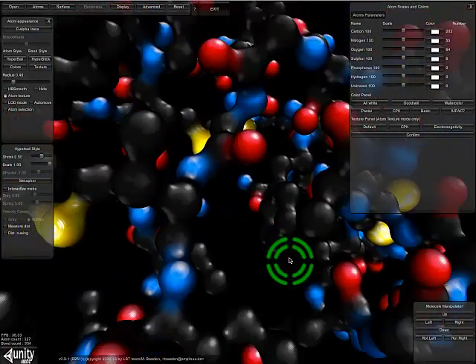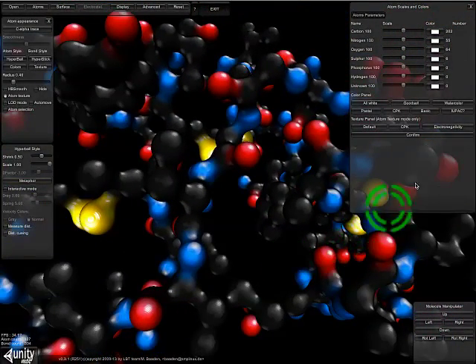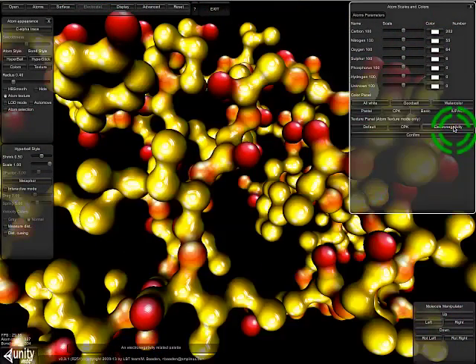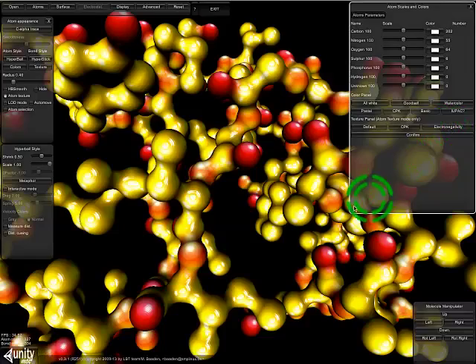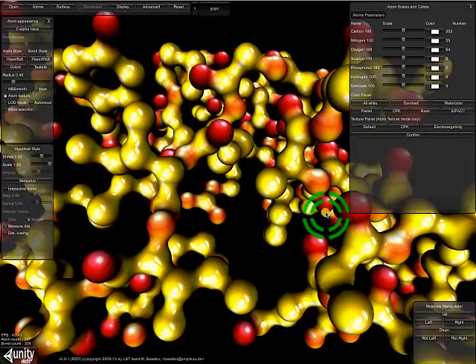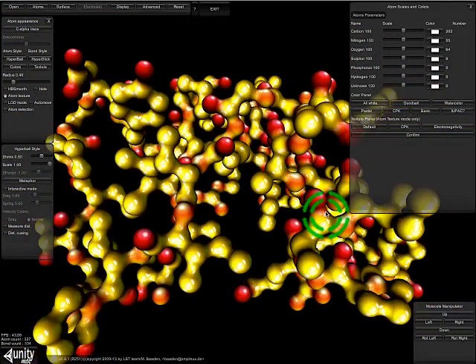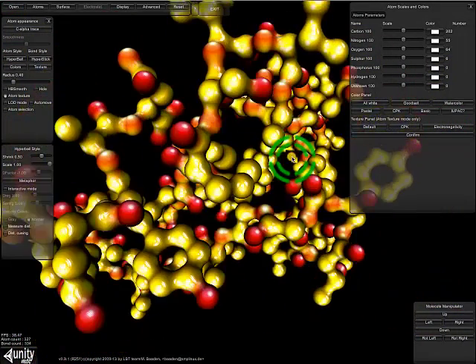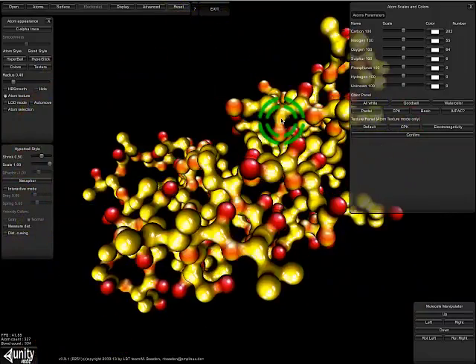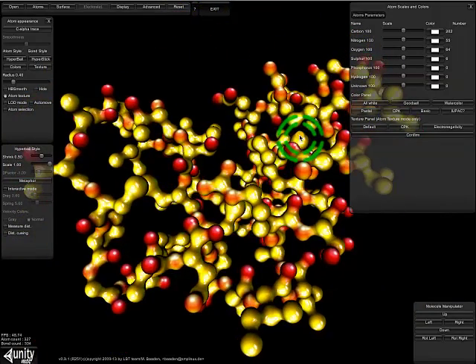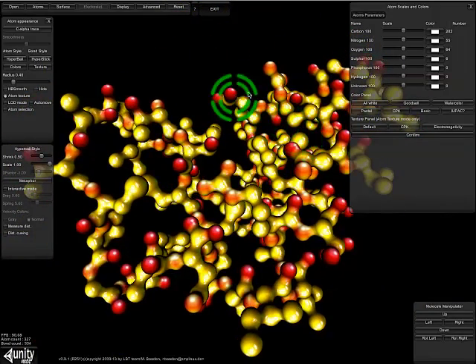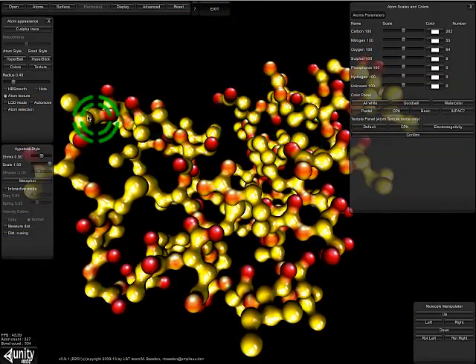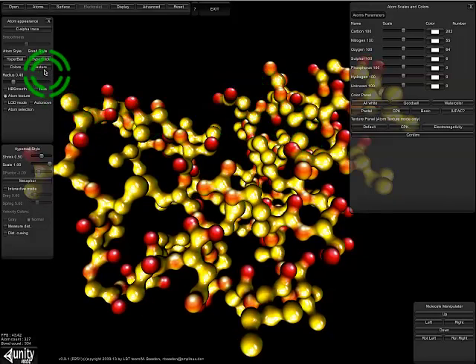Another color set that's proposed is electronegativity. Click here, that's more colorful, and the redder it is, the more electrons an atom draws to it.